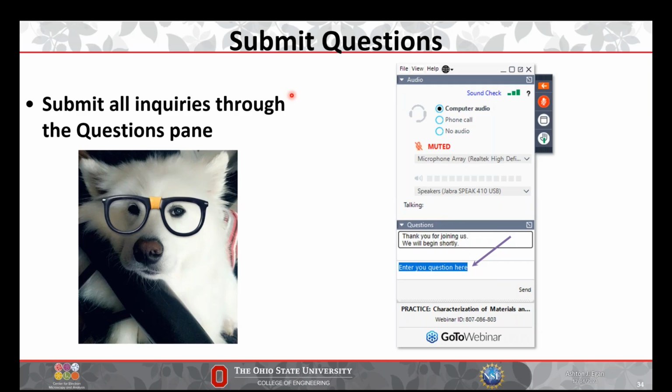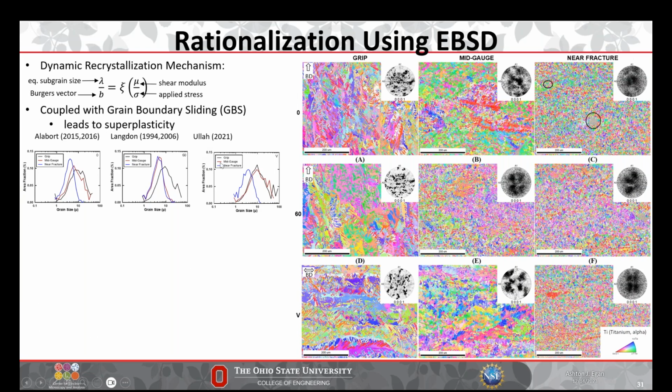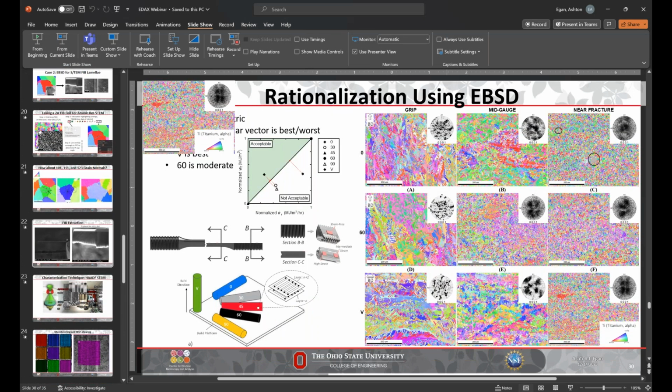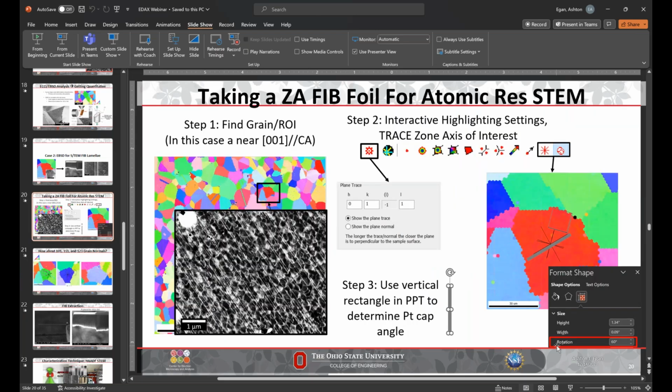But in TEM, you could tell the difference between gamma and gamma prime. If you're talking about ECCI, I think maybe I did show this in one of my ECCI images. Let me quickly go back here. You can actually see the gamma and gamma prime. So this is one example.